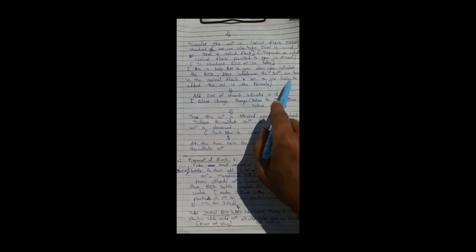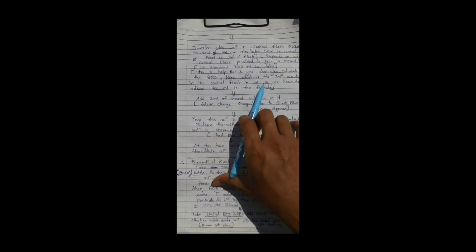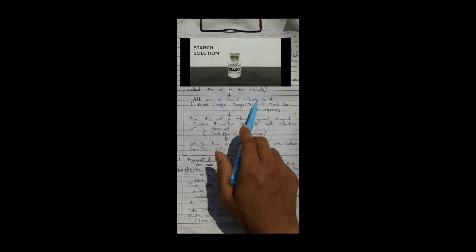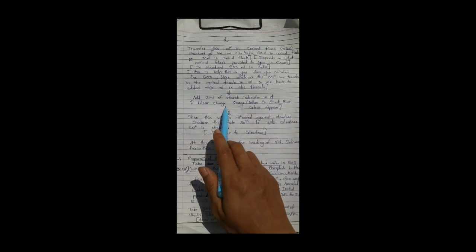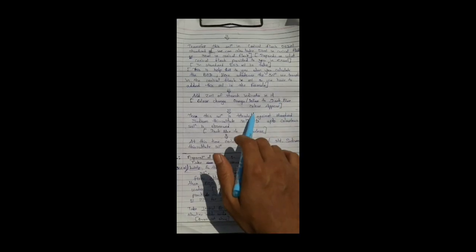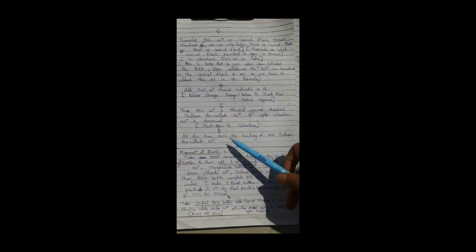Whatever volume of solution we transfer into the conical flask, in ml, we have to use in the formula. After transferring the solution into the conical flask, you have to add 2 ml of the starch indicator in the blank and in the sample. The color changes completely from orange to dark blue. Then this solution is titrated against a standard sodium thiosulfate solution. The dark blue color completely turns into a colorless solution. At this point, you have to note the reading of the standard sodium thiosulfate solution for the blank and the sample.